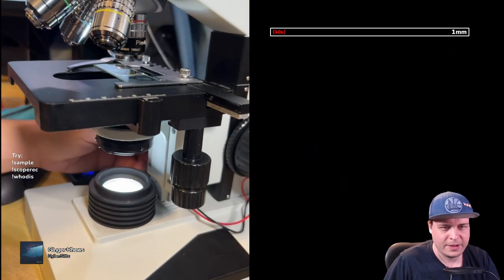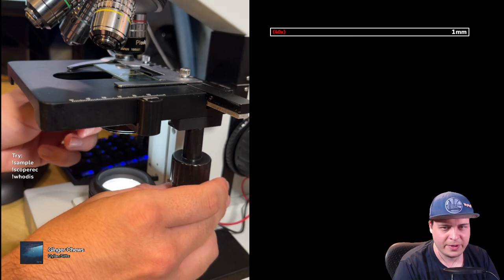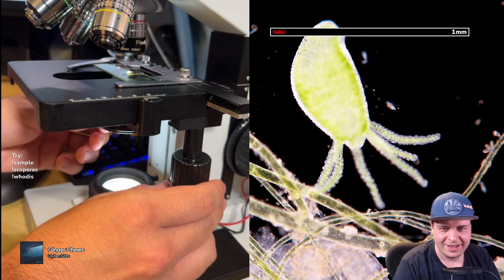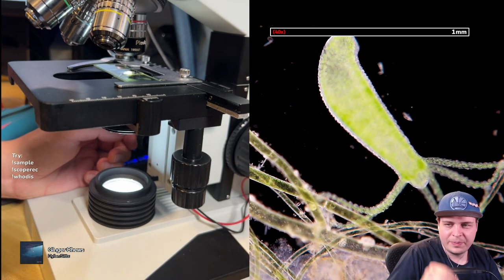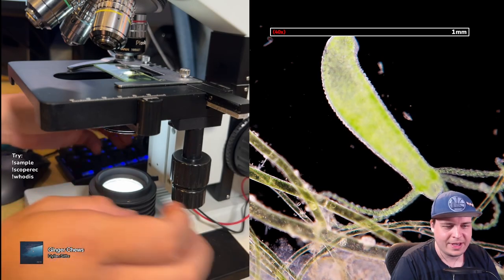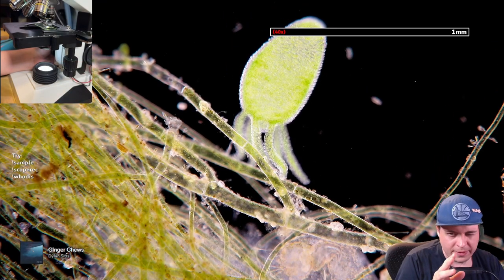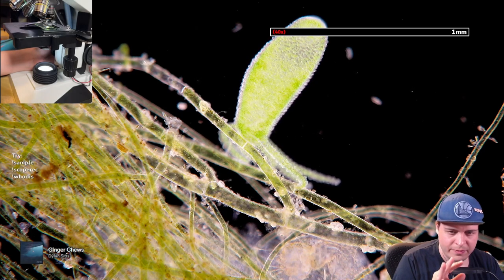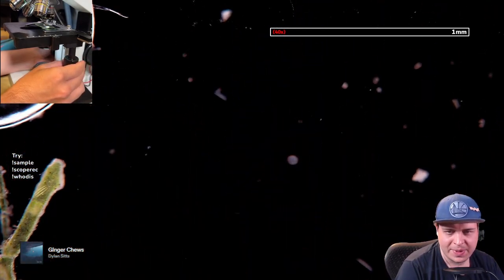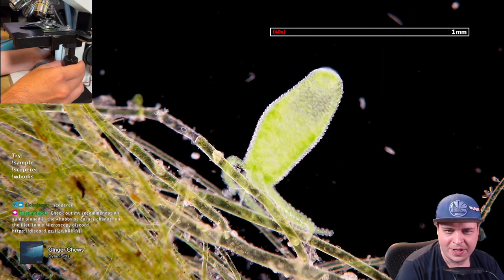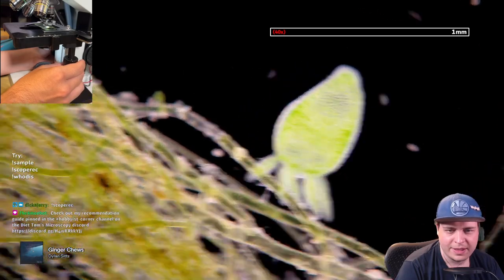One important thing for dark field: you always want your condenser as close to the slide as possible, and your iris all the way open. If you close the iris too much you'll block everything out, so keep it wide open. The super blackness you see in the background generally comes from how you set up your camera, but you can do that on the iPhone too — I show that in that video.